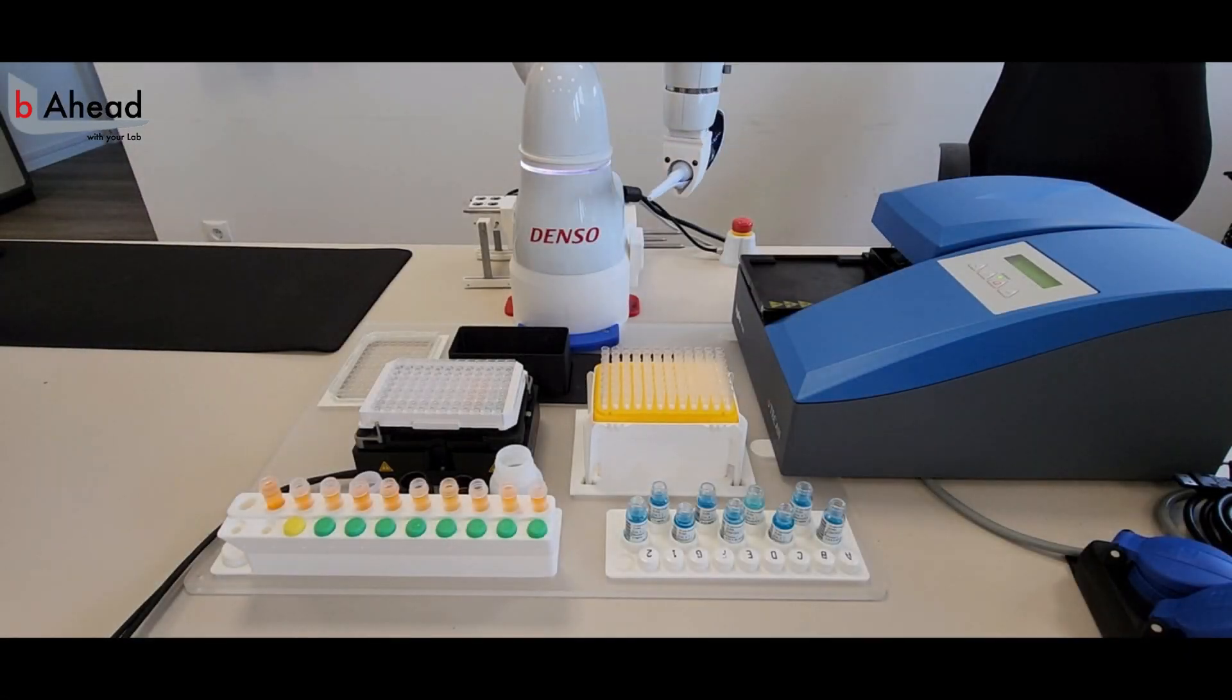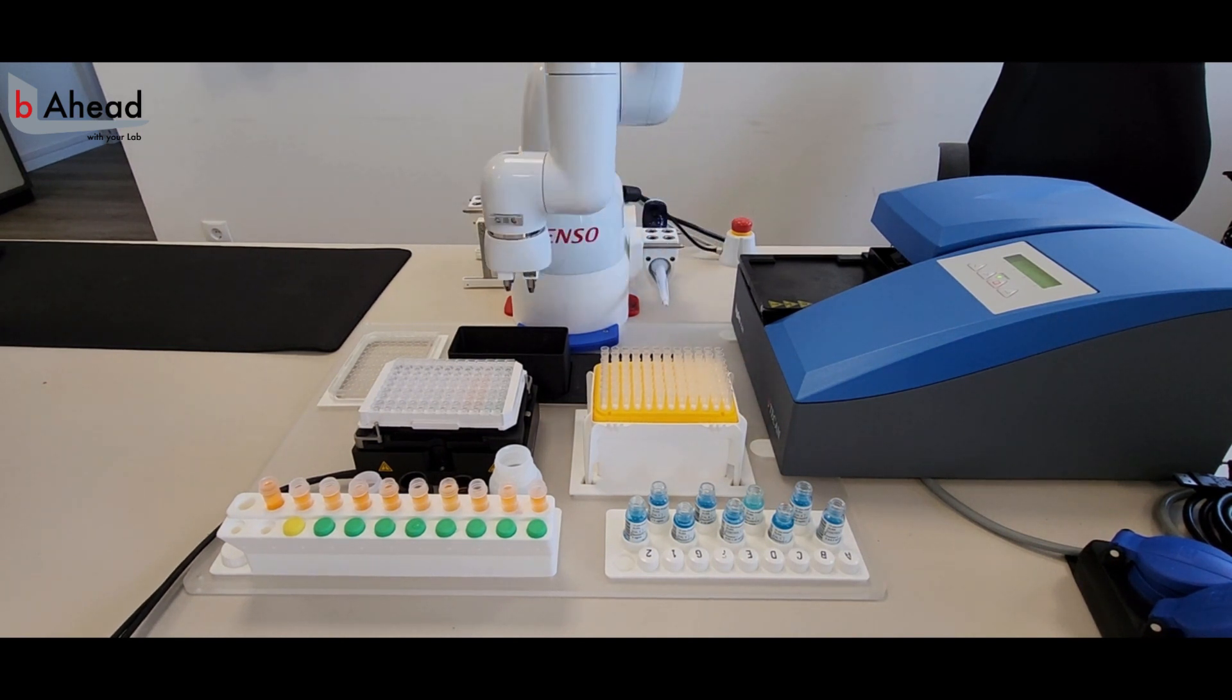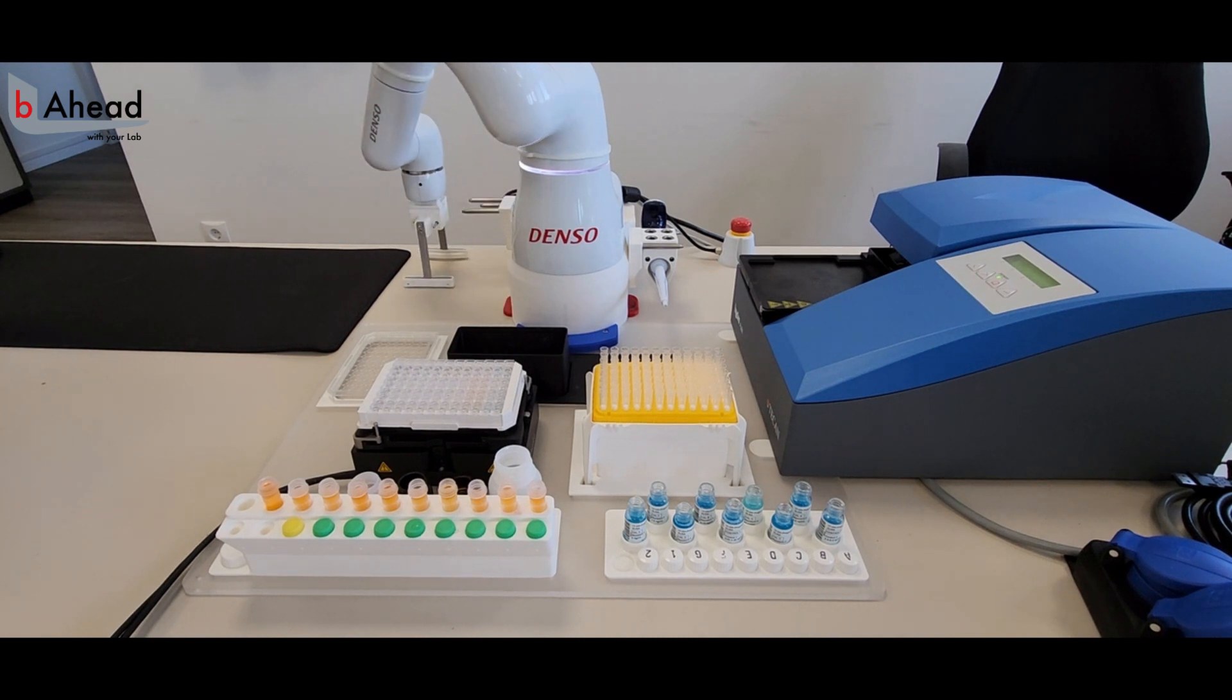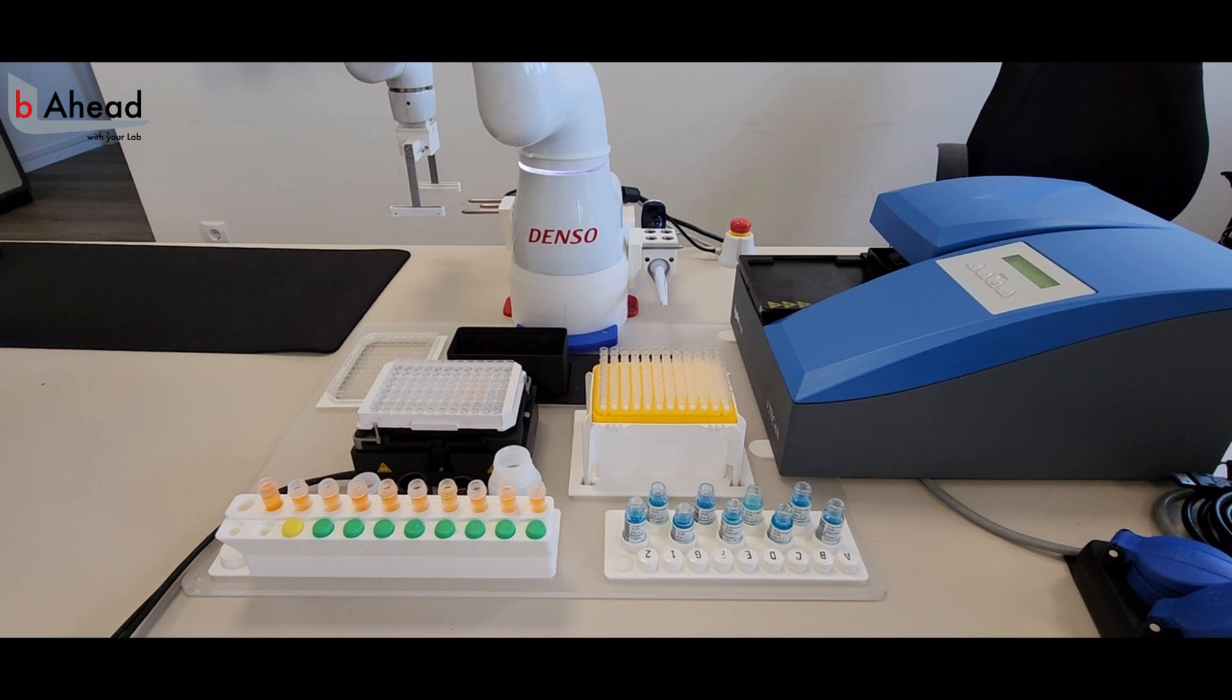After completing the first liquid handling steps, buddy changes the pipette for a microplate gripper to cover the liquids. We have integrated a mixer from Q Instruments that is also controlled by buddy and mixes the liquids before keeping them at a steady temperature for incubation.